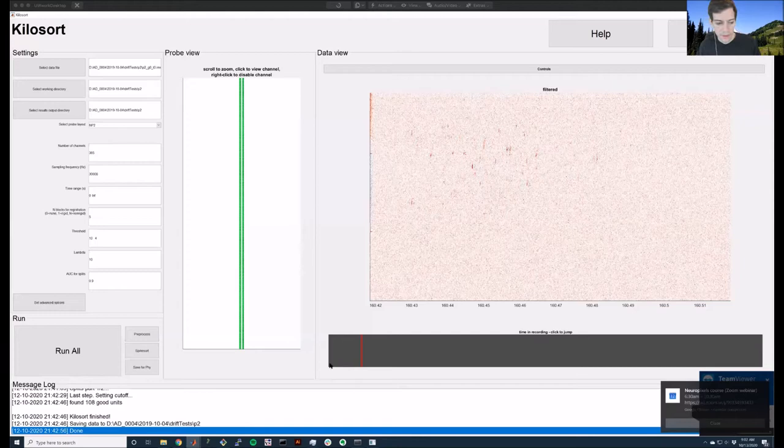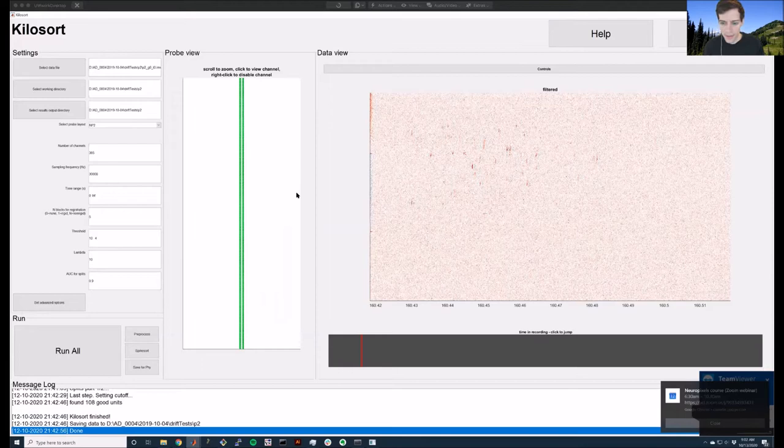Installing Kilosort is pretty easy. There's some setup for compiling the GPU functions, but once you set up your compiler correctly you should be able to come into MATLAB, add Kilosort to the path, type Kilosort, press enter, and it will come up with this view.